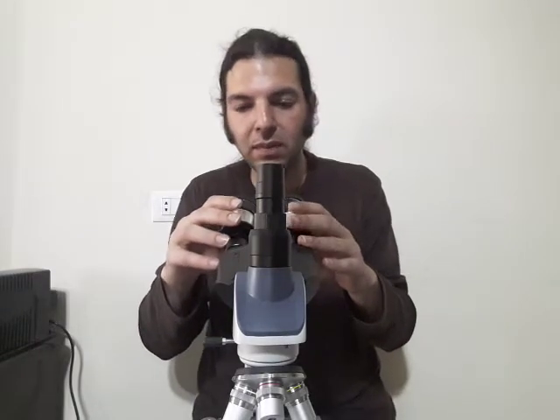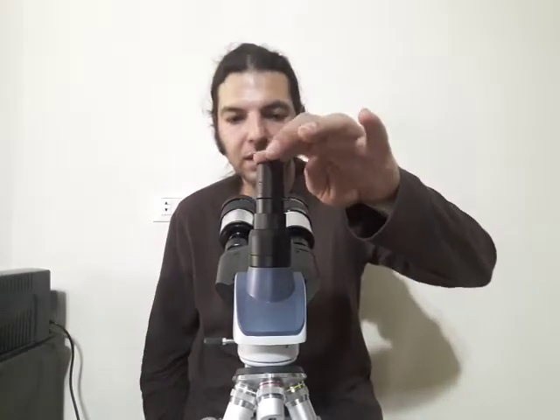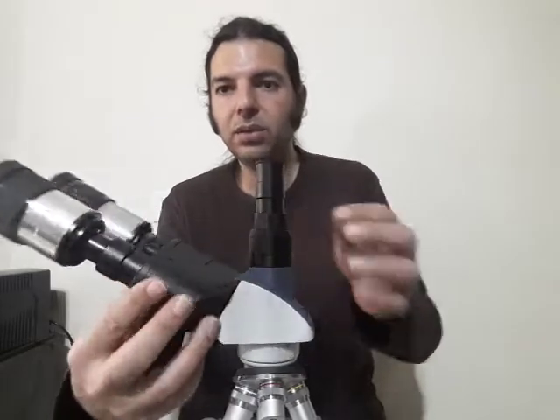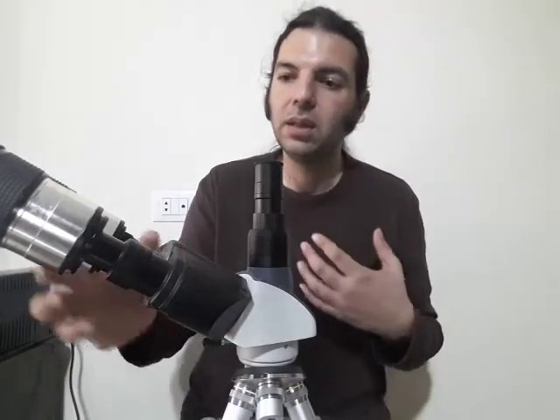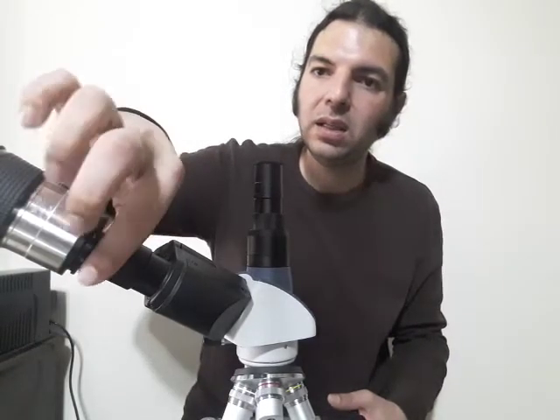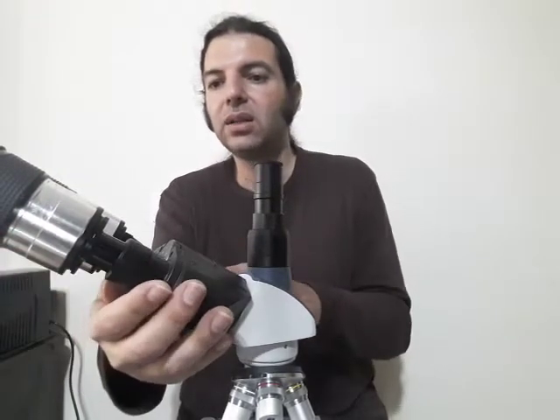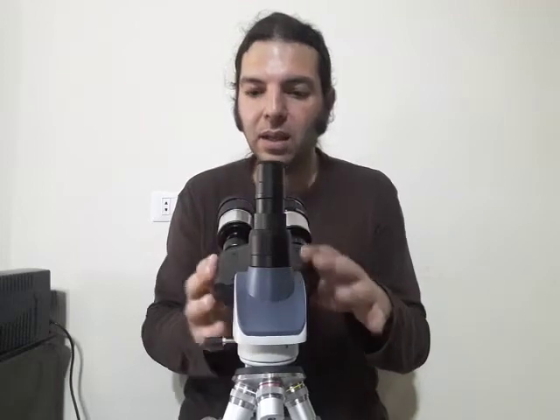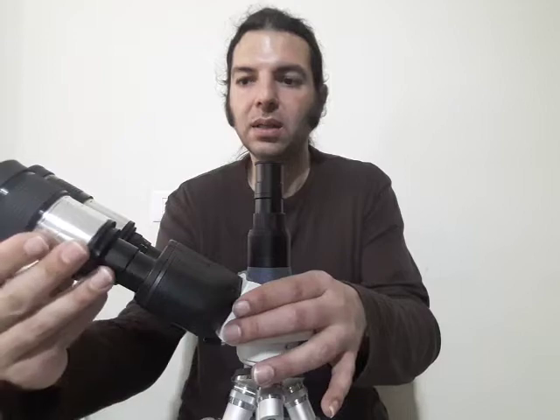You can just add any spacer ring here to compensate the height so both eyepieces are level. This prevents one eyepiece from sitting too deep. I do have a good interpupillary span here and we'll see what happens when I look through both eyepieces.